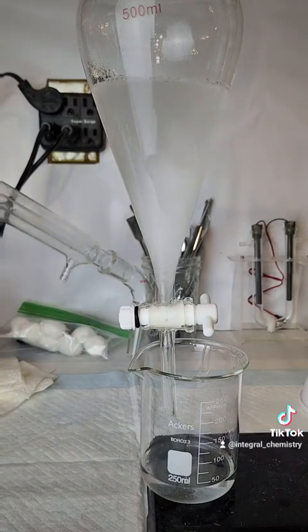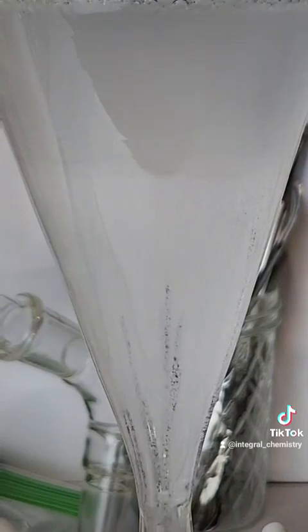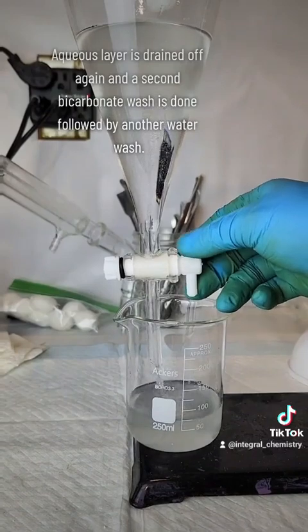In all of these steps, my aqueous layer is going to be my lower layer, as ethyl acetate is a lot lighter than water. Since I'm doing a washing here, the lower layer is the one I'm going to drain away. This property is one reason that DCM or chloroform might be preferable to ethyl acetate in certain types of processes.